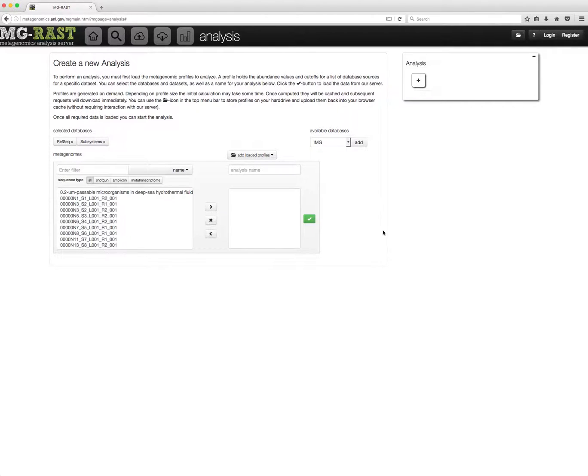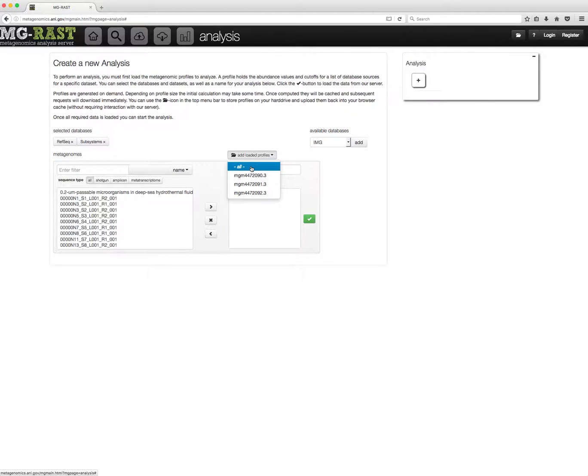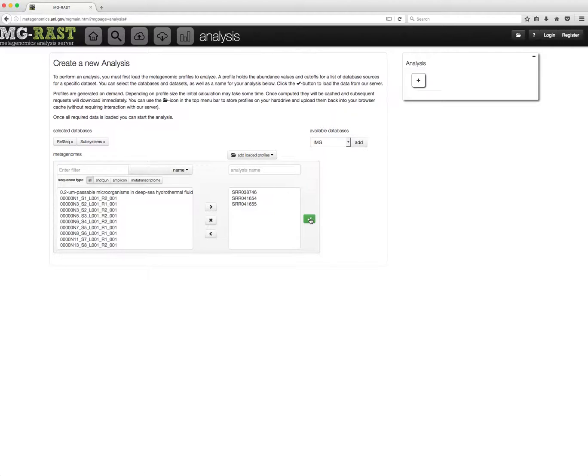Loaded profiles can be selected via a drop-down menu. Analyses generated on already loaded profiles are generated instantly.